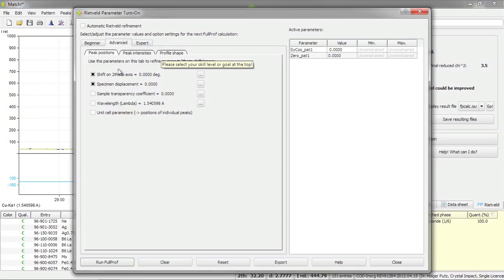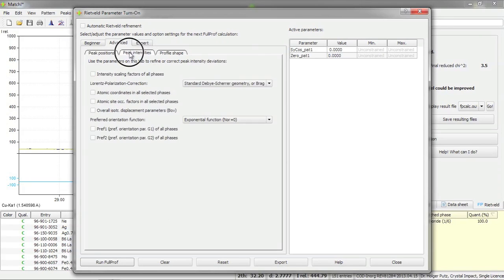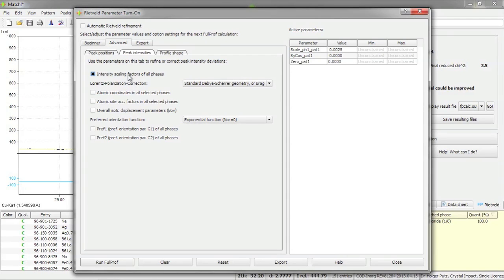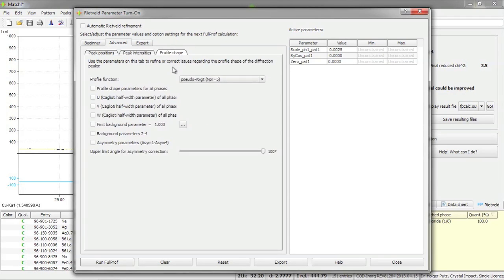In addition to the two theta shift I would also like to refine the scaling factors.